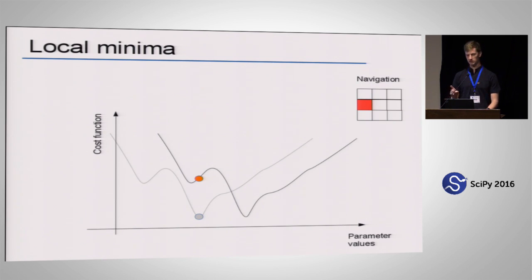The first one is that it only ever used the last point of information. It ignored the first 2 pixels, right? It only used the very last one in that line. That's obviously not a smart thing to do. You should use as much information as possible if it's useful to you, of course.